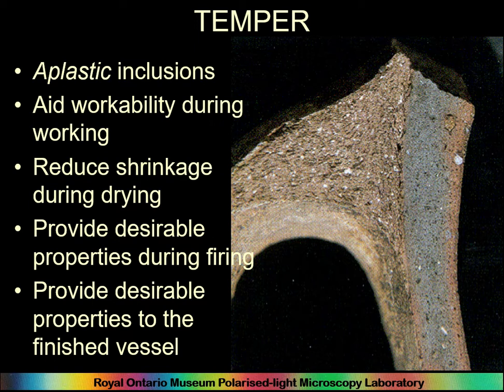So I usually use this slide because it shows these are all mineral inclusions, and this has few and this has many, because this is a handle which has been added to this piece of pottery after this piece of pottery has already dried. And so that means the shrinkage will be much less, and it's less likely to fall off. Whereas if the pottery vessel and the handle were made at about the same time, then they would shrink at the same rate and it wouldn't be a problem. But in this case, they allowed it to dry, and here they're making sure it doesn't shrink too much.